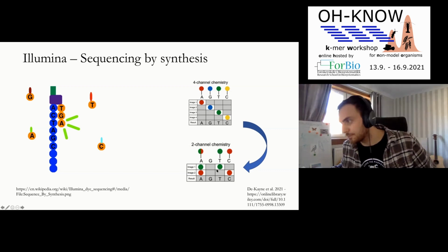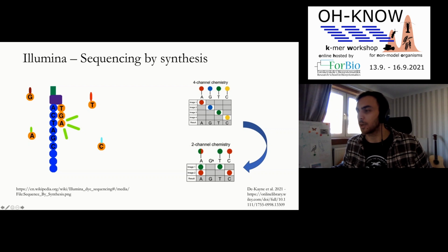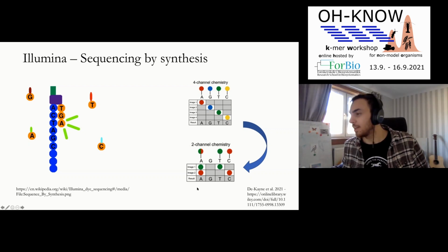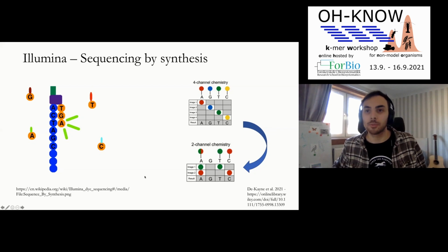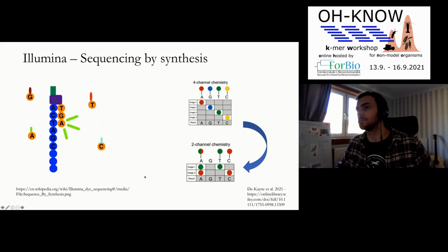Those of you who've worked with data might already see the problem here, which is that if your machine doesn't work, or you get a round which doesn't work, or a cycle which doesn't work, I should say, you will end up with a G call in your NovaSeq data, which is not a real G call. It could have been anything. So although this technology was designed to increase throughput, there are some drawbacks.